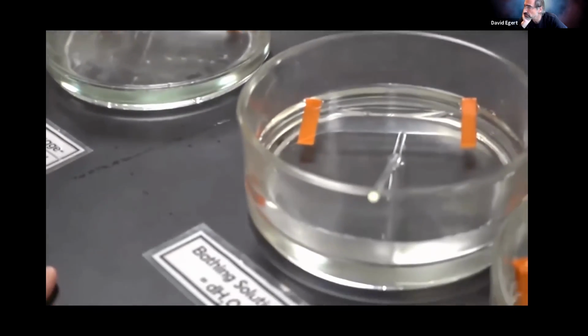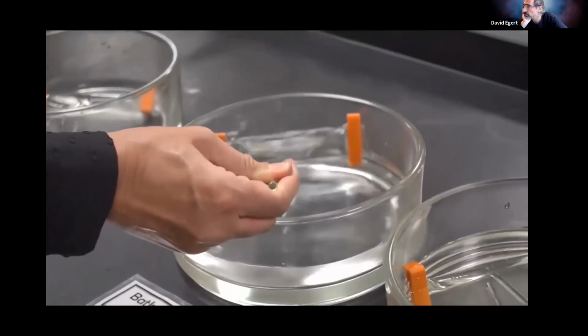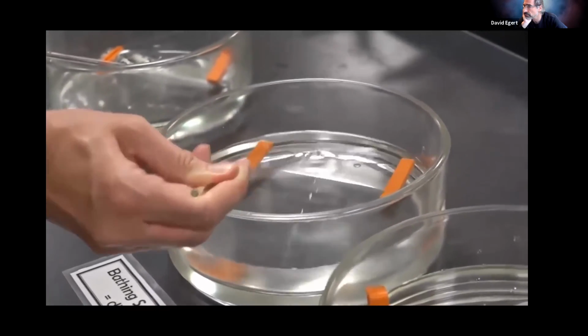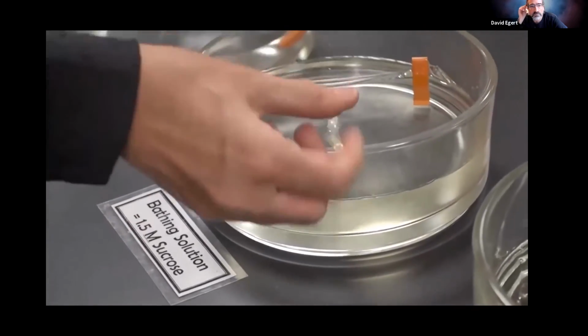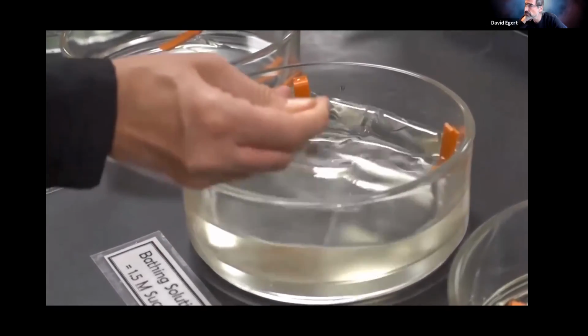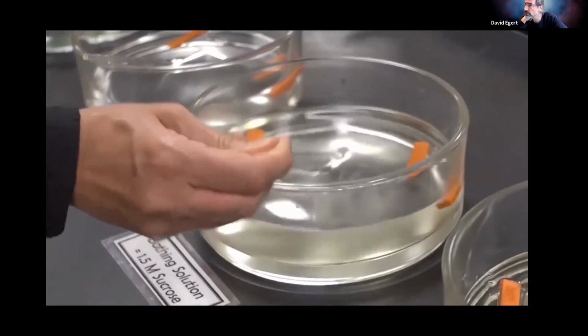This one has been in distilled water, and if I push on it and lift it, you can see it's very rigid. So this one has taken in water and got quite taut and rigid. This one has been in the same concentration as we put inside the tube, and so it's very much like the control sausage, the same consistency.